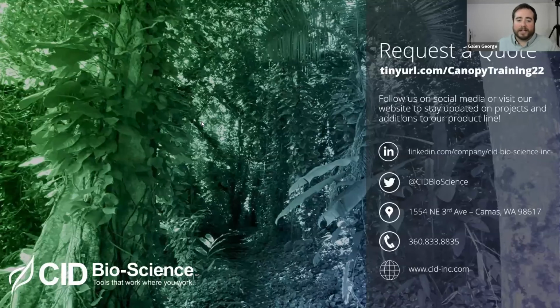The biggest thing with hemispherical photography is doing your best to remain consistent. As I mentioned, you're always facing north when you take your images, and you're always applying the same filters to everything. That is the main difference there.